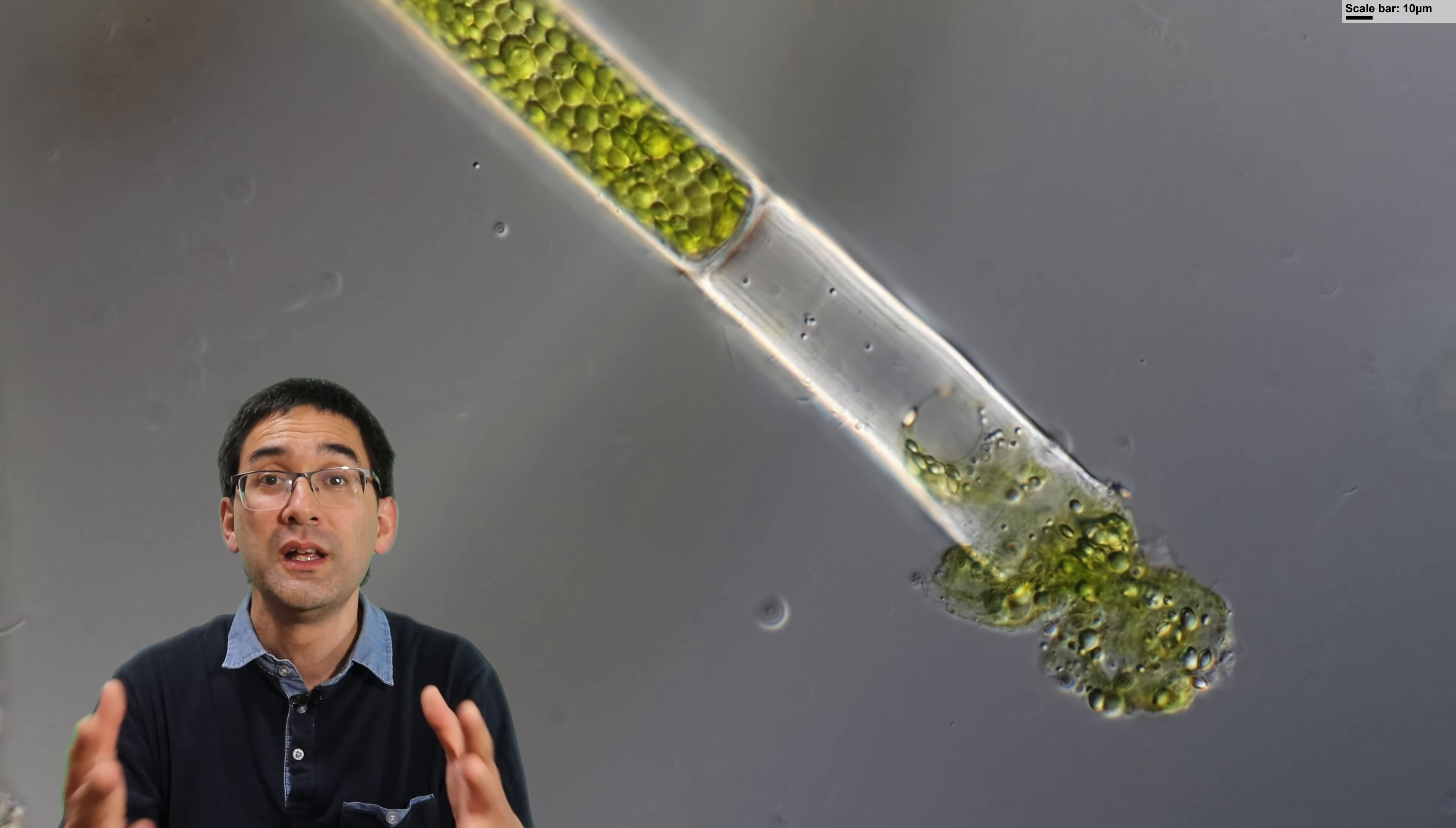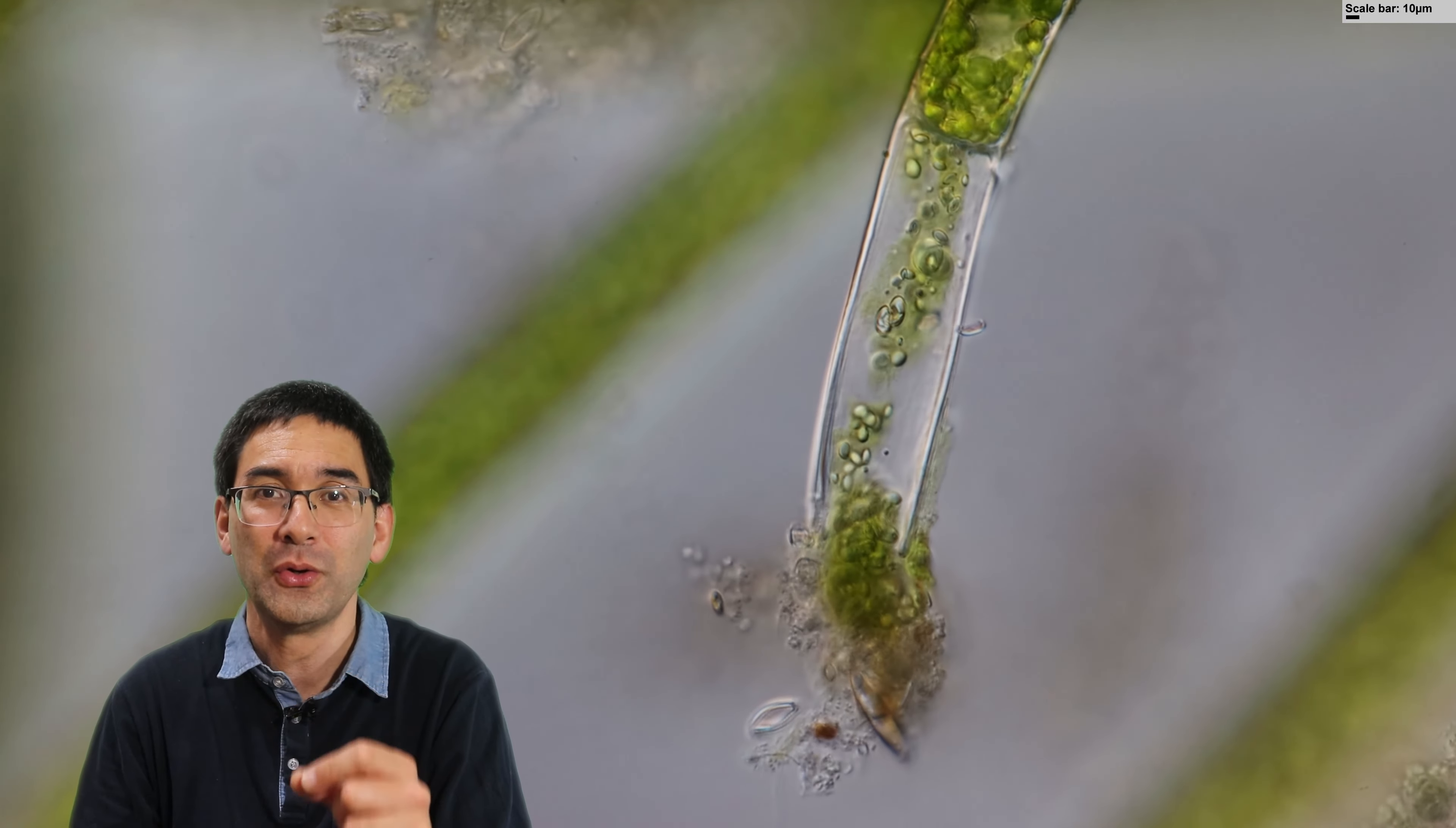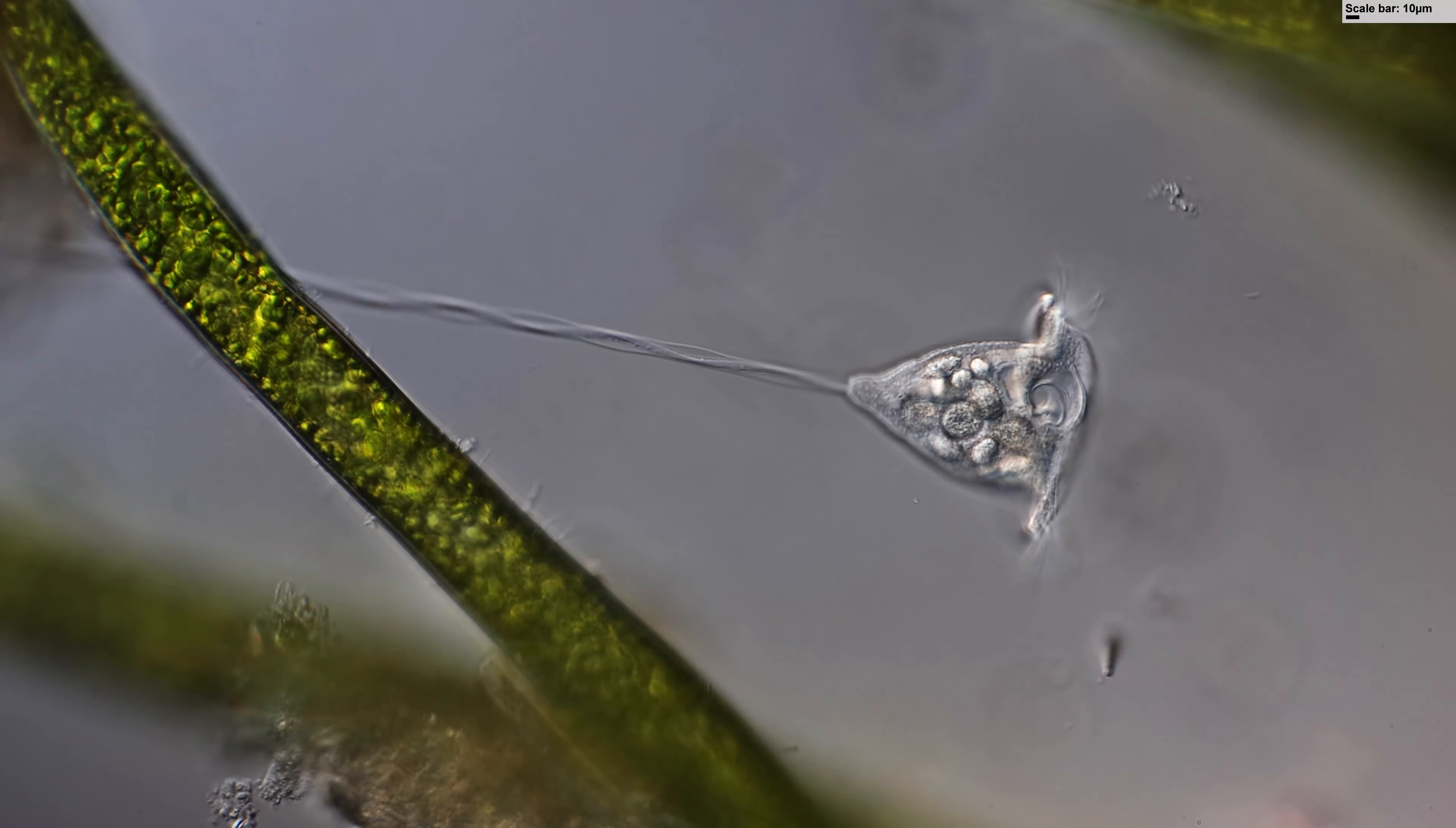Some of the cells that you see over here seem to be cut open, and the cell contents are spilling out. The reason is when I took out those filaments from my jar, I had to cut them off using a scissor, and this caused some of the cells to break open and spill the contents out.